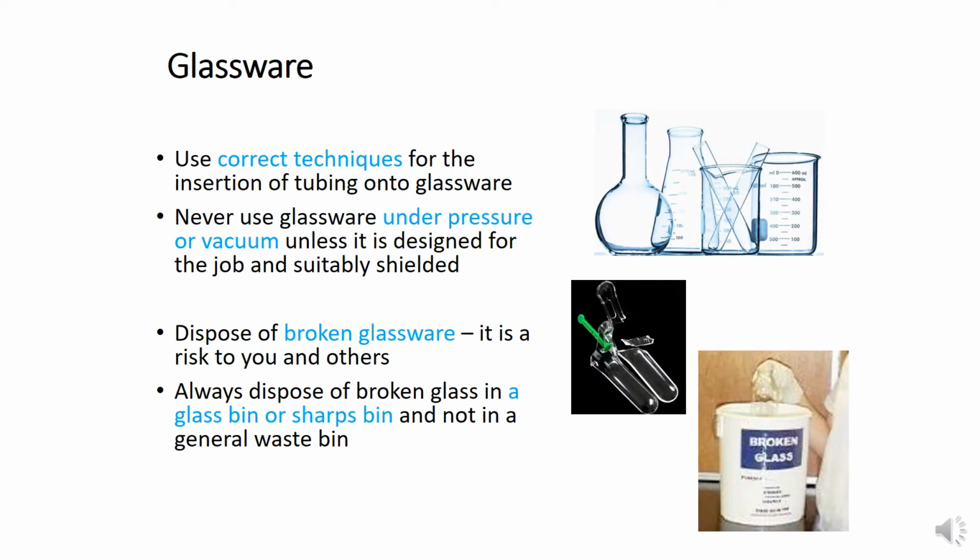This is very basic information about glassware, like the correct techniques for insertion and for using glassware, because it is very delicate. Whenever we use it we have to be careful about whether the chemical is very cold or very hot, or whether there is pressure or vacuum. If we insert something heavy, like a heavy metal, inside the glassware, it can break, for example during washing.